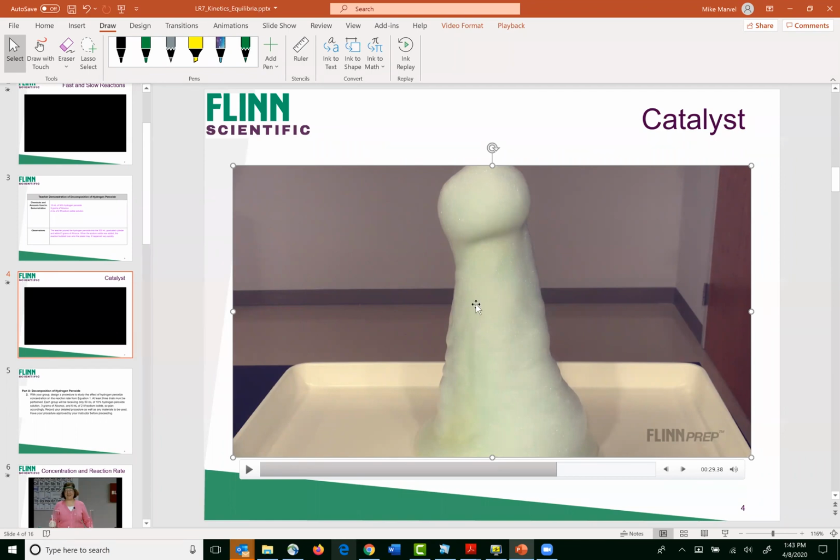If you do this in plastic, you start to see some fusion, some melting of the plastic because the temperature is so high. But that kind of vapor you see there, I think was the question, that's water. So it's not necessarily smoke as much as it's water vapor.